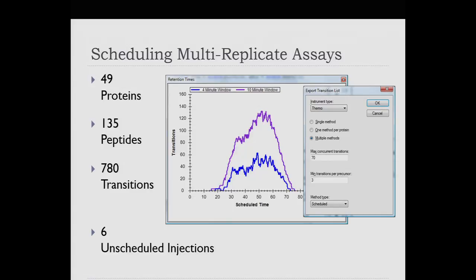That initial detection phase led us to finding 49 proteins for which we had any hope of measuring without further sample preparation. So in the very simple, probably depleted plasma preparation that we did, we found 49 of the 109 proteins. And if we wanted to find more, we would probably have to change our sample prep.